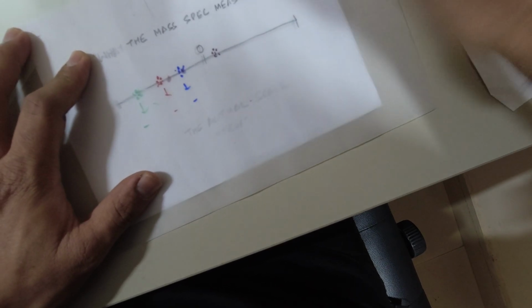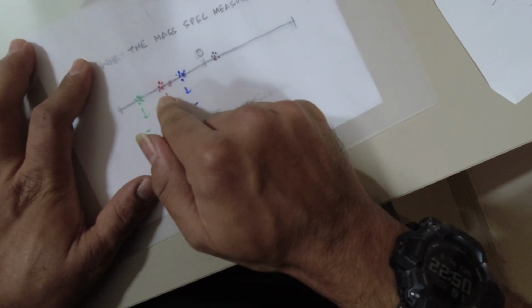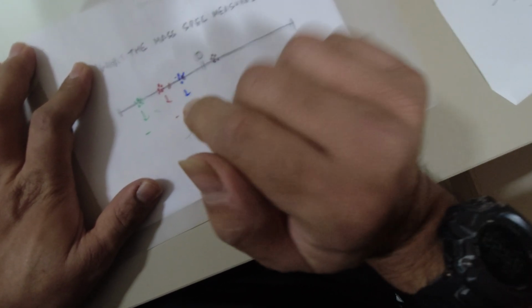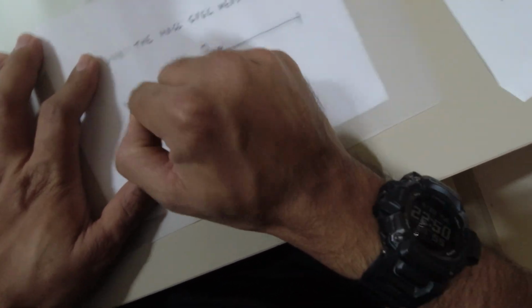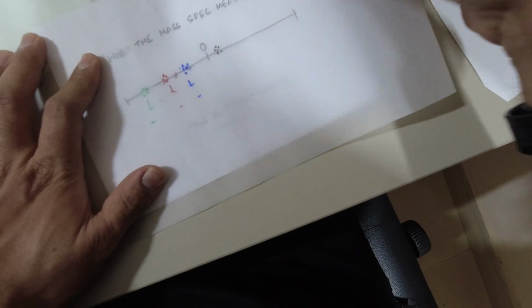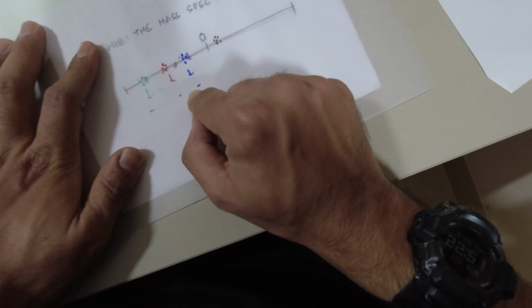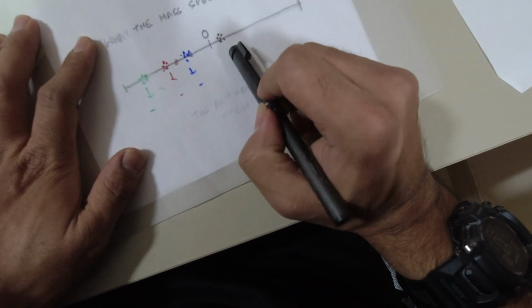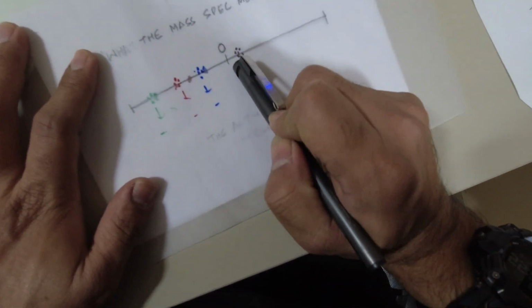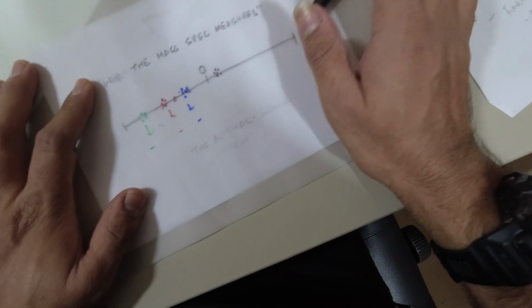Because I know the values of each of the standards, the green, red, and blue, I'm going to match the scale underneath so that it coincides with the actual values, and therefore I know the actual value of my sample. This is what I've understood so far.